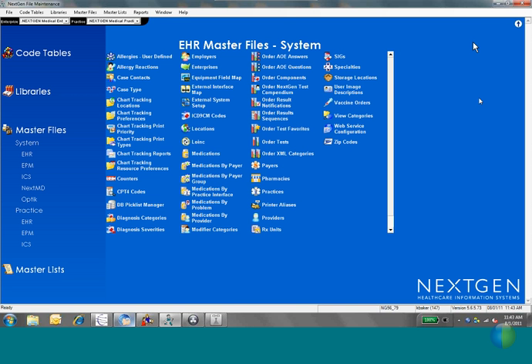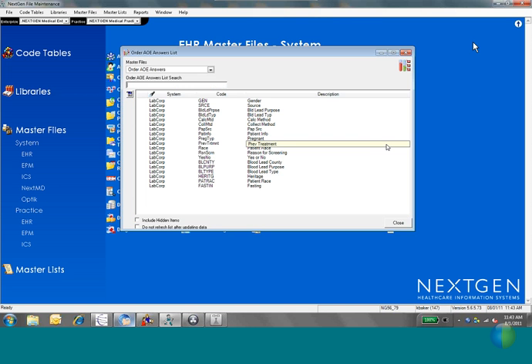Gosh, I can't really think of that many others. Maybe the PAP source as well. I think I've got a couple other examples in here. Heritage, blood lead county, that kind of stuff. So all of these kind of things had possible answers. So instead of free texting, you want to create a pick list so that the user picks one of the possible answers.